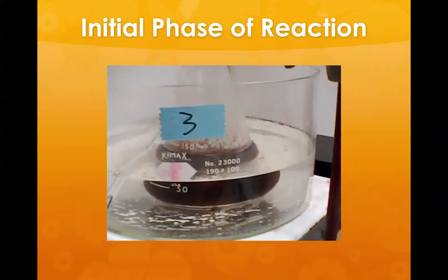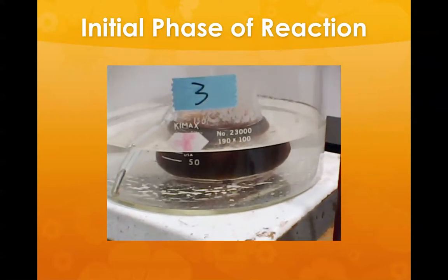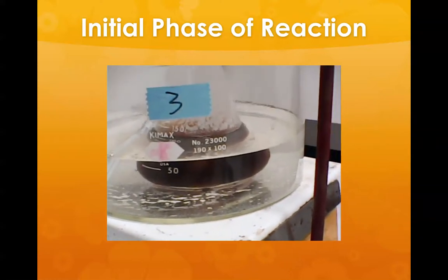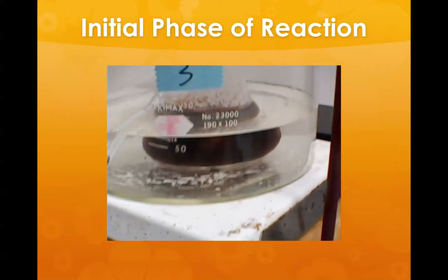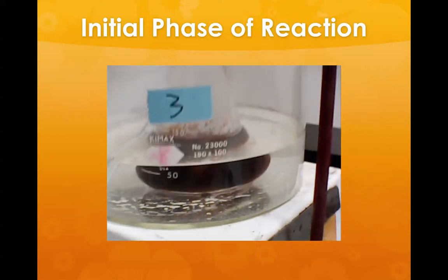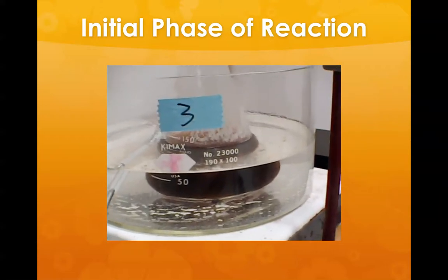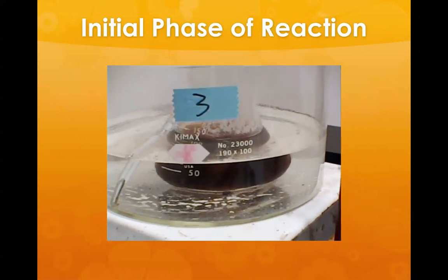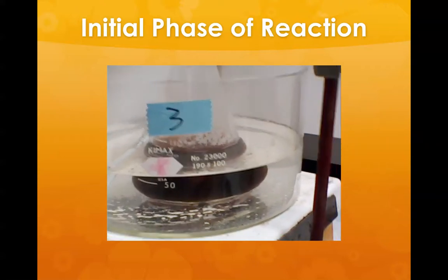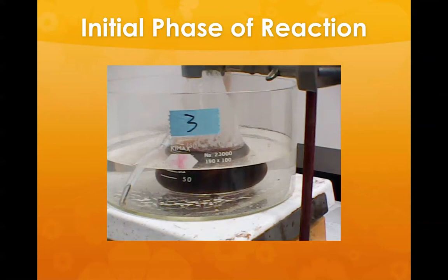During the course of heating at 190, racemization will occur of the L amino acids, two of the three here, glycine being achiral. So there will be a certain percentage of the D enantiomer incorporated into the chain. According to the European patent, molecular weight should be 2,000 to 3,000 Dalton units. So it's a rather small polypeptide, a very small protein if you want, proteinoid. And I'll be determining if fiddler crabs, I'm doing chemical ecology work with them, will ingest and metabolize this material. The second amino acid is going to be added very shortly.